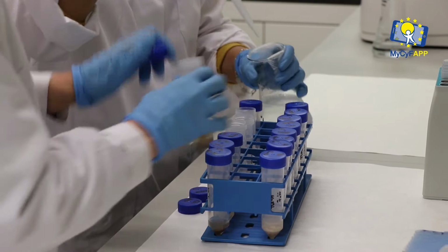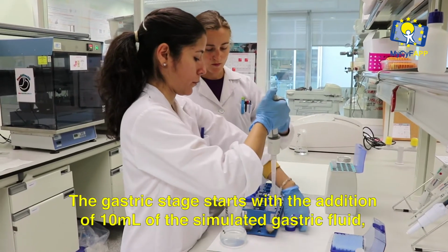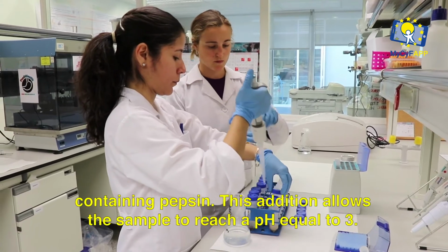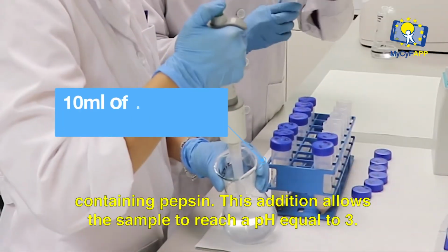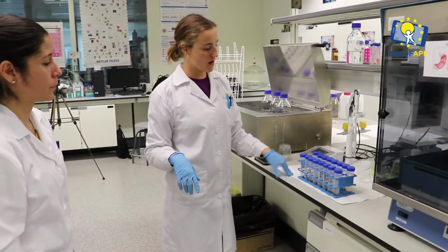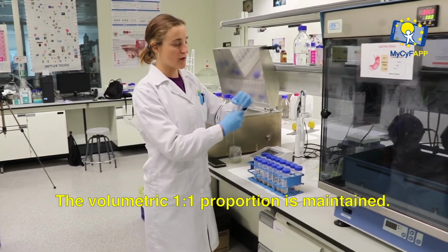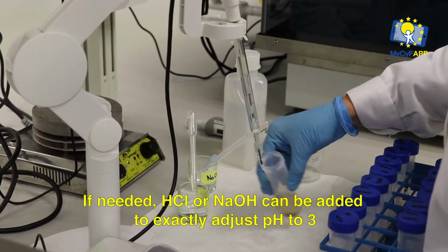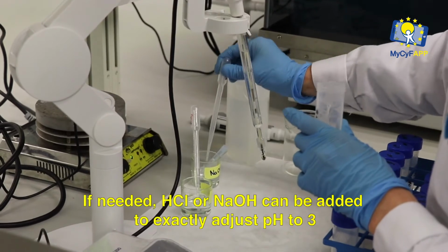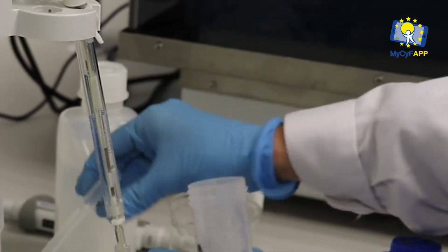The gastric stage starts with the addition of 10 milliliters of the simulated gastric fluid containing pepsin. This addition allows the sample to reach a pH equal to 3. The volumetric 1:1 proportion is then maintained. If needed, hydrochloric acid or sodium hydroxide can be added to exactly adjust pH to 3.